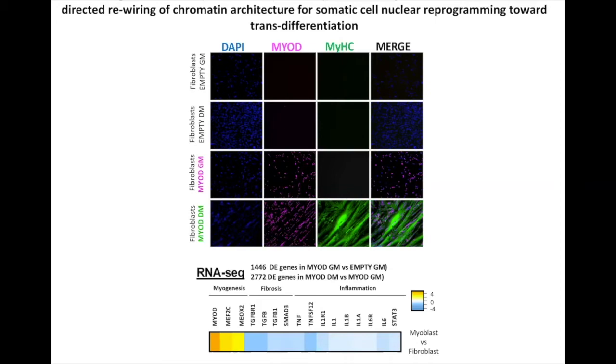You see that the large majority of the fibroblasts express MyoD, and at this stage, we have RNA-seq, where you can appreciate that something very interesting happens. This is the expression of myogenic factors and the consensual erasure or repression of a lot of markers of the fibroblastic cell line. Later on, this results in the formation of multinucleated myotubes.